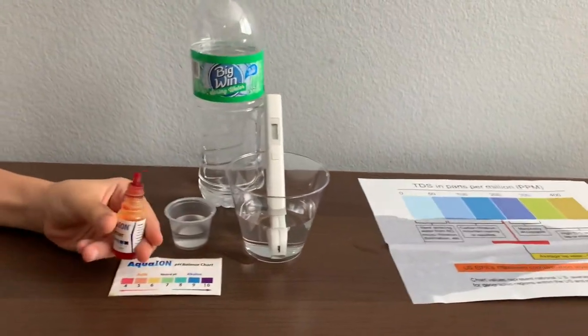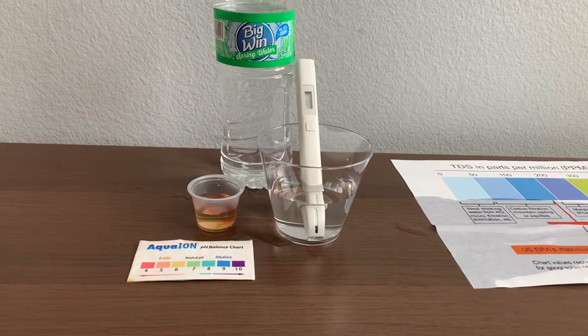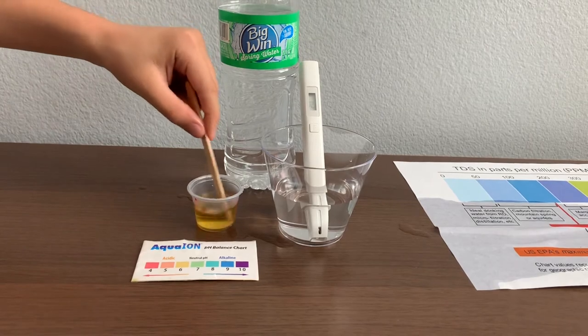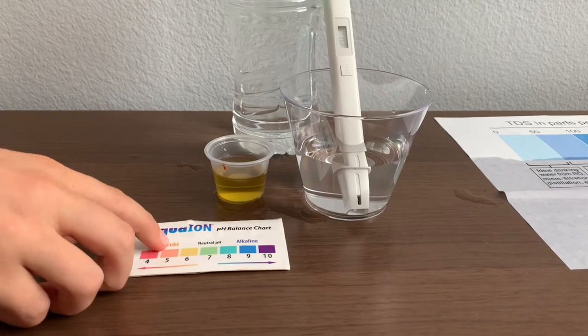Now let's test the pH level. Only use two drops. Let's stir it a little for a better result. I give this a 6.5 — this is acidic.